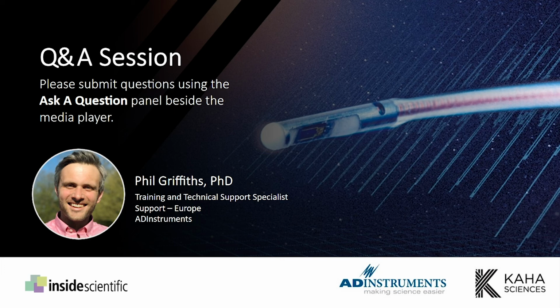The answer to that is that you can't at the moment. So each time that you explant them, you'll have to trim the lead wire a little bit. And the best advice that I can give to maximize use is to keep the amount that you have to trim those leads to a minimum.